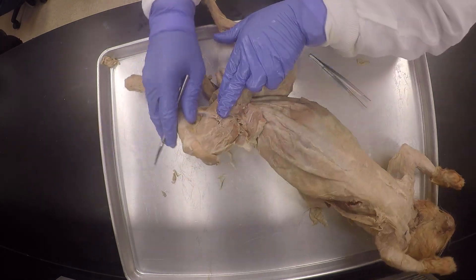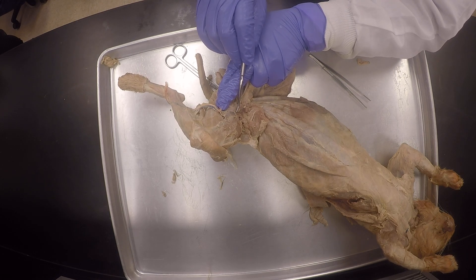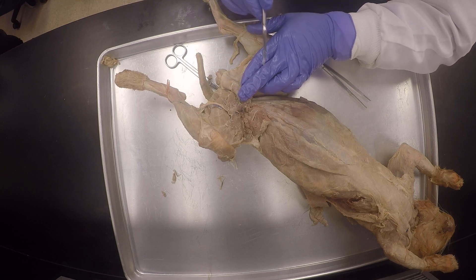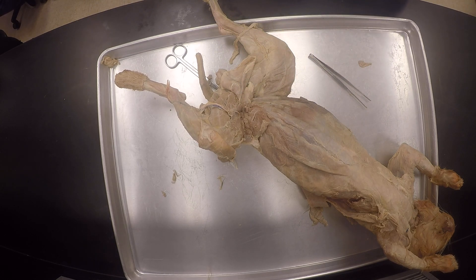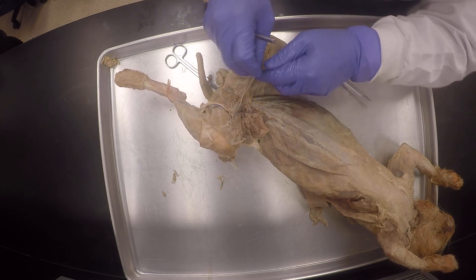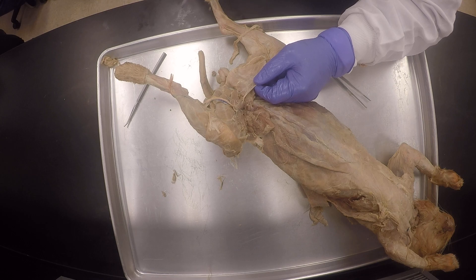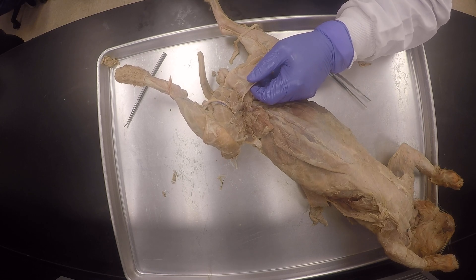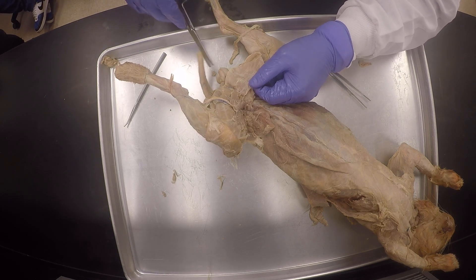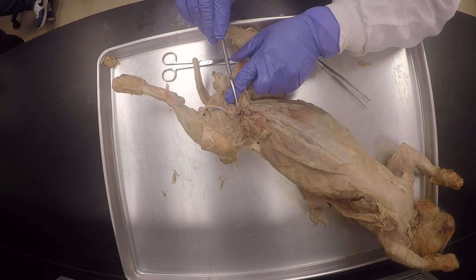So now I'm going to free up this adductor longus. Next to it will also be the pectineus muscle, which is kind of also in there. You will see it listed in the book and lab manuals, but the pectineus is not on the list. So whatever is not on the list, if I point it out here, I won't put it in the exam because it won't be fair. Only what's on the list can come in the exam, but I just try to be complete and show you everything.